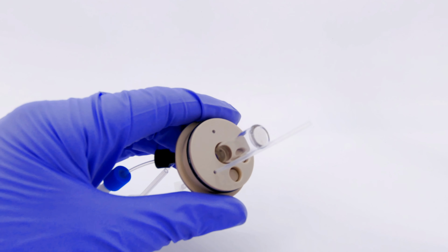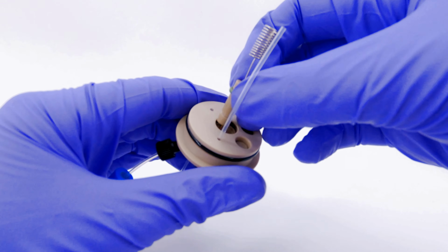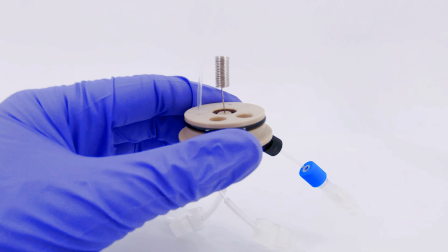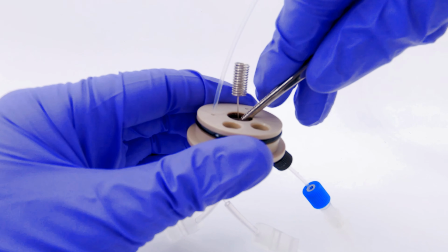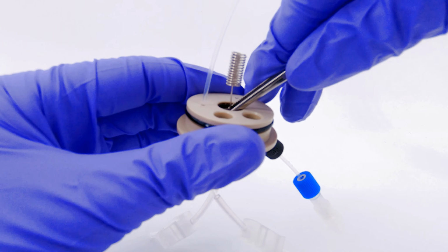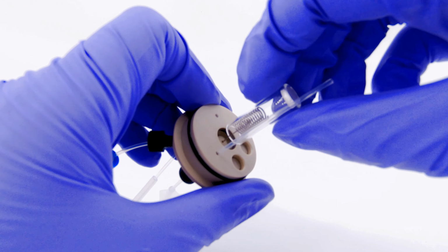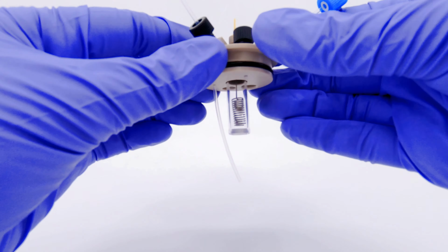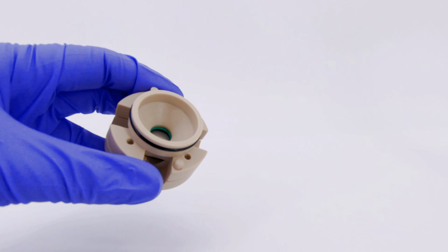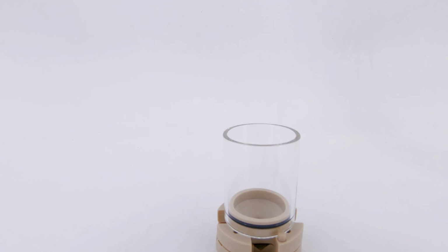Move on to the lid for the two-compartment cell. Start by removing the inner compartment with a gentle twist and pull. Next, fit the counter electrode into the lid, and using tweezers, push the plug in to ensure an airtight seal. With that in place, you can then return the glass compartment into its position. Now for the reassembly. Twist and push the glass body onto the base, followed by the lid.